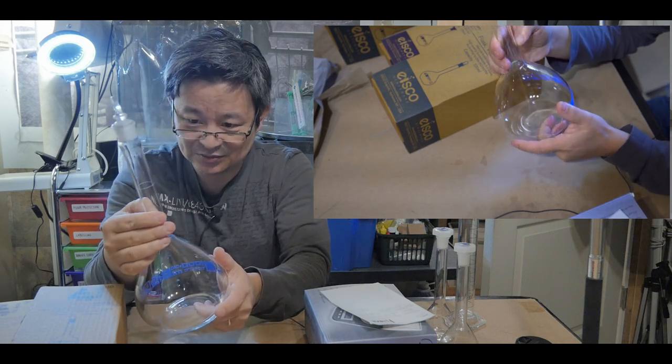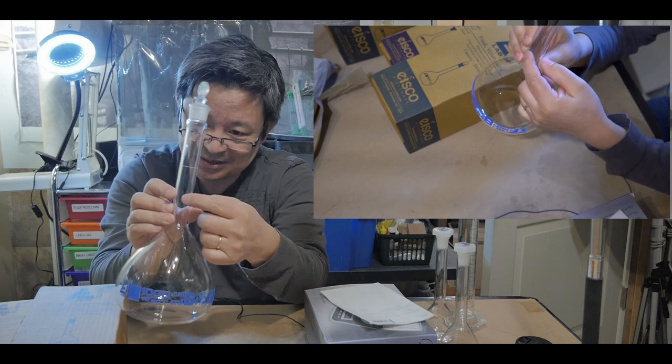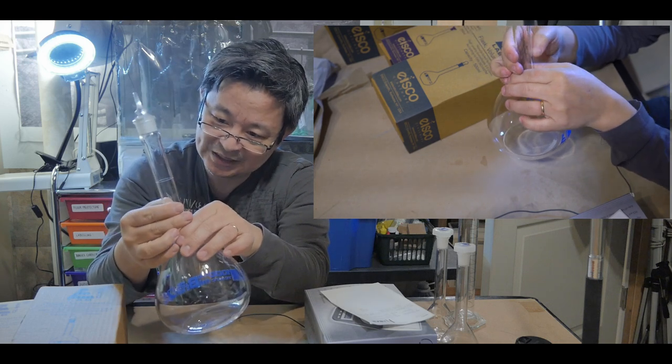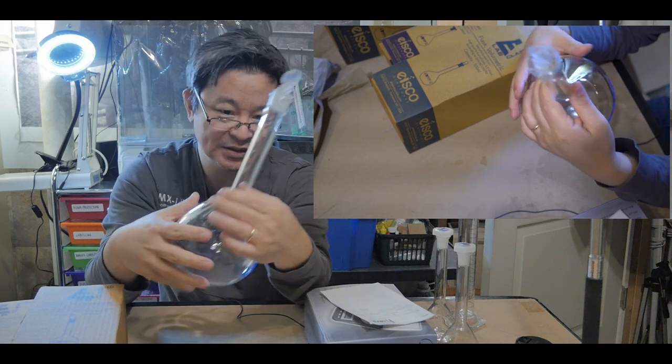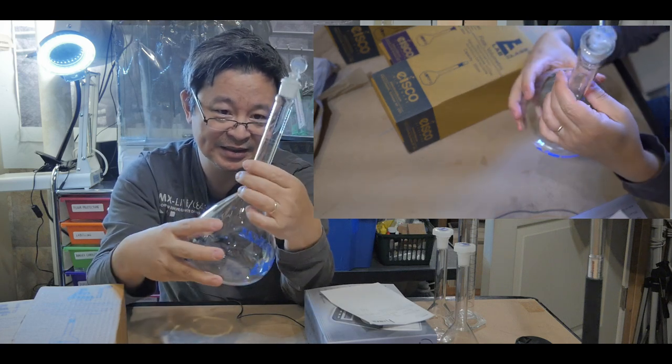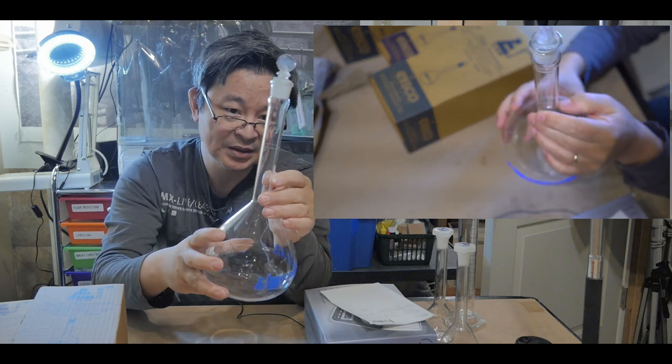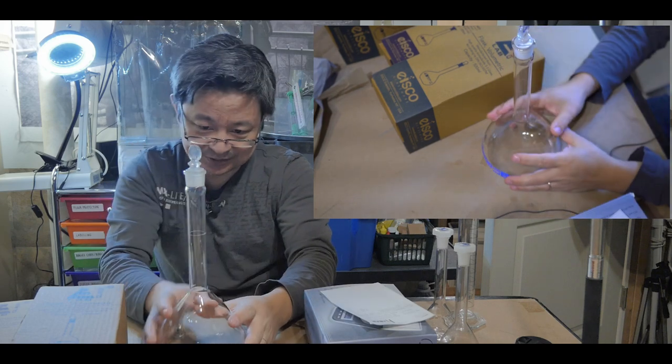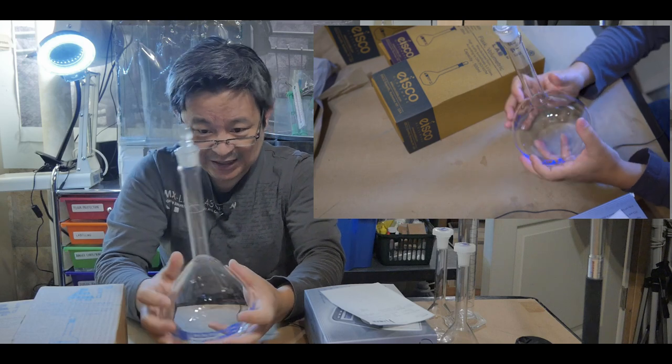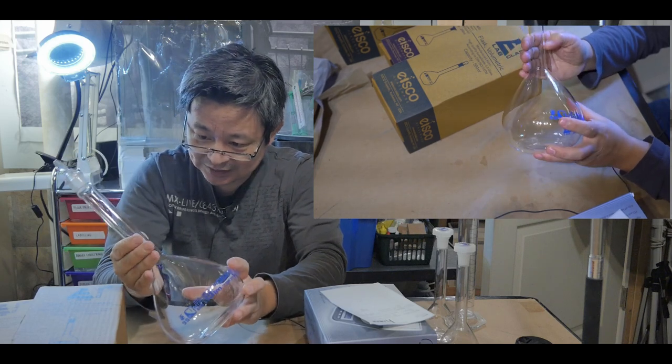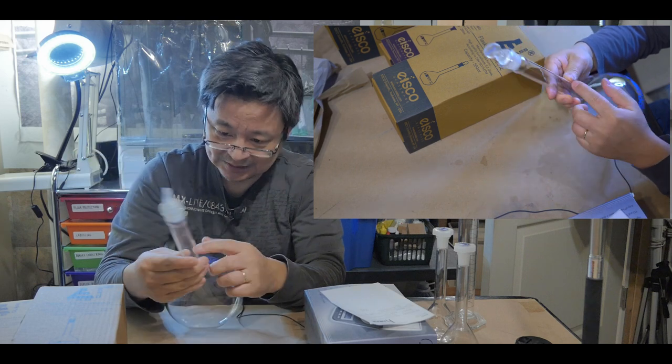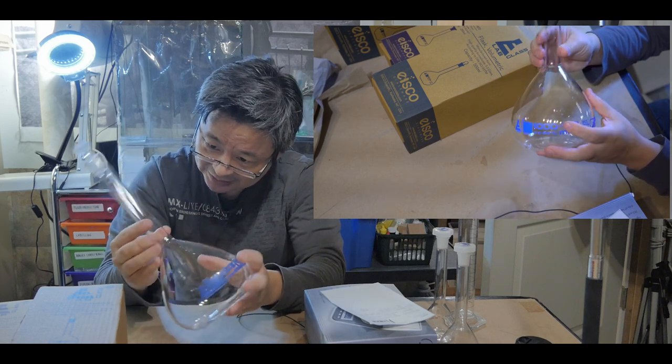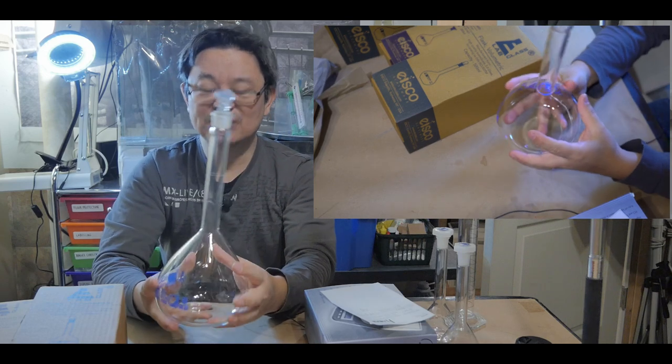Talk about reliability, right? I mean, that is amazing. Oh, oh no, I hope that's not a crack there. Oh boy, there's a little bit of a crack here. It's not a crack, it's like a little scratch, I guess you'd call it. Hopefully that's not going to turn into a crack. Okay, there's one thing I don't like about buying online - because during delivery there could be a crack somewhere in the glassware. Now this is the B grade, this is the B grade, and maybe that's why it's not, you know, like new. There's some kind of scratch on the glassware. Hopefully that doesn't turn out to be a crack. So I think it's okay, it's just a little scratch here, a little scratch there. I just want to try to save money.